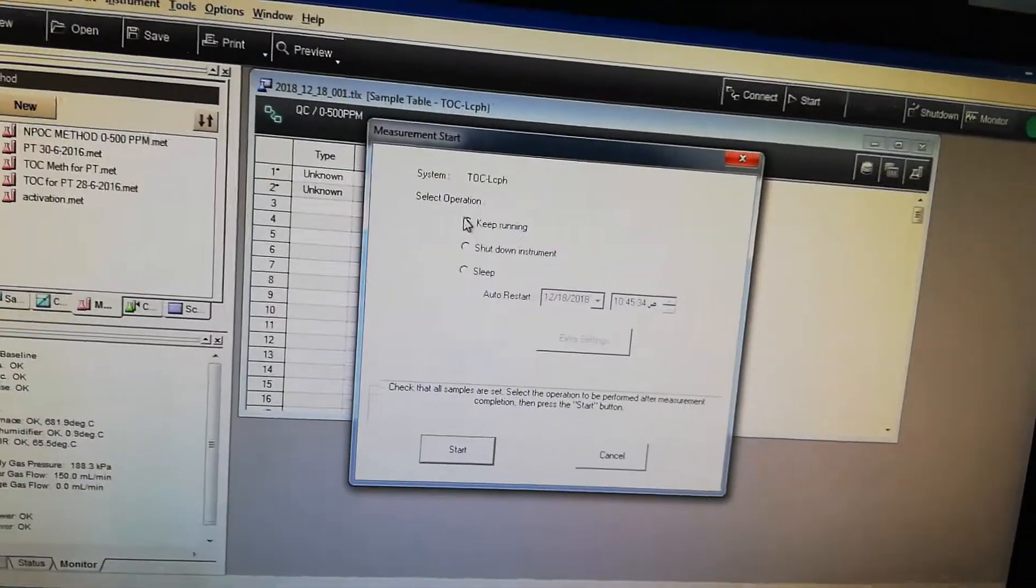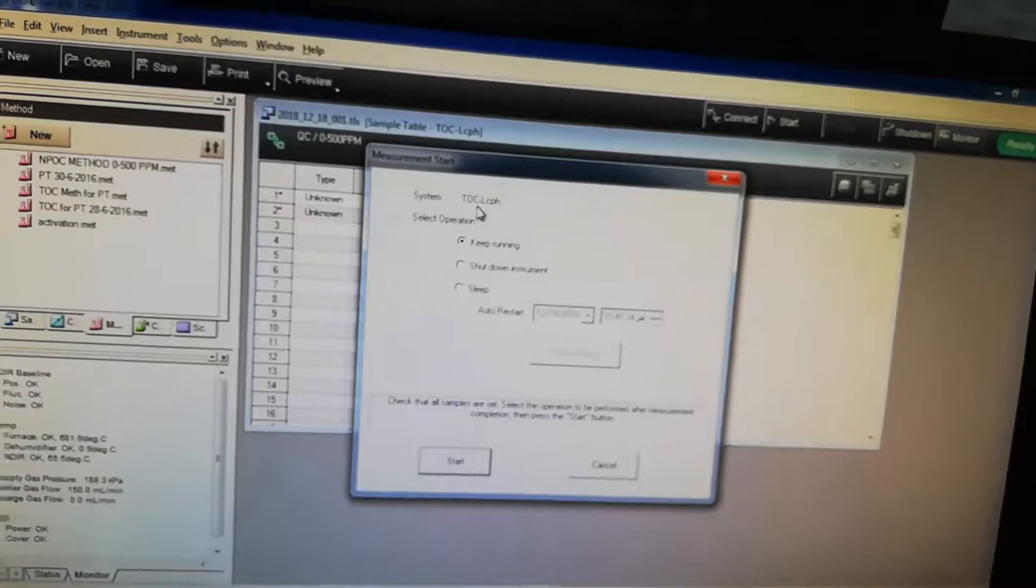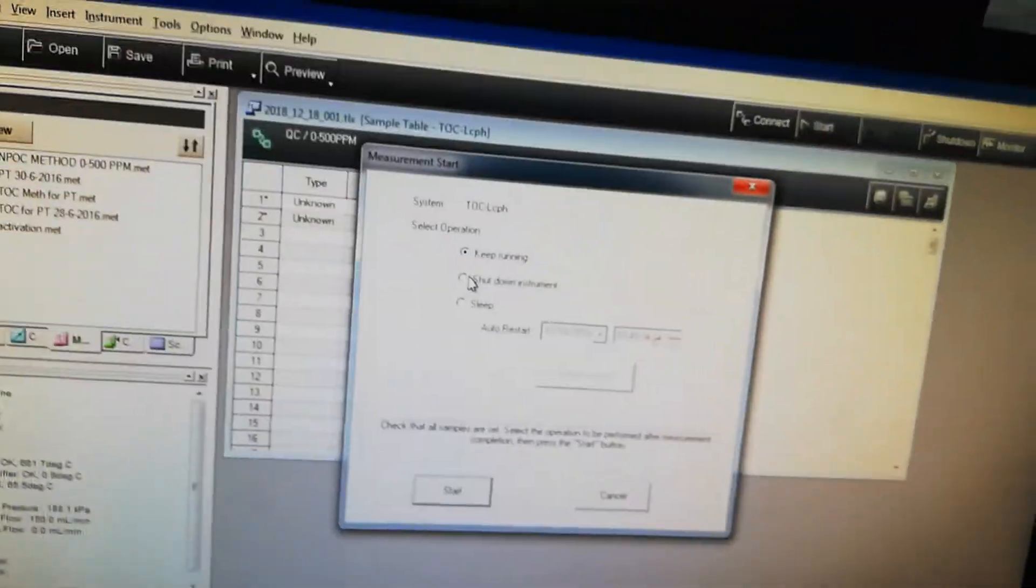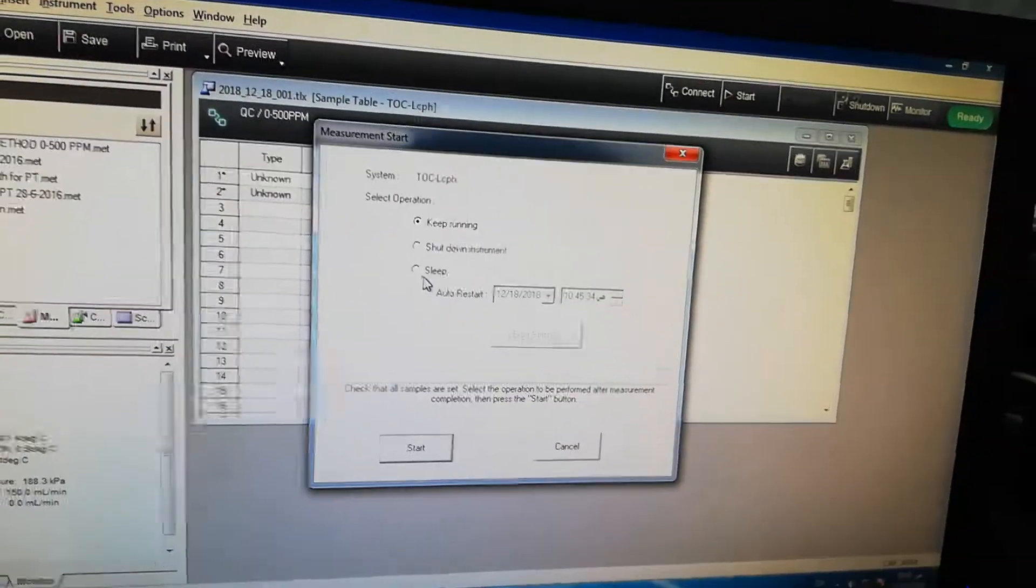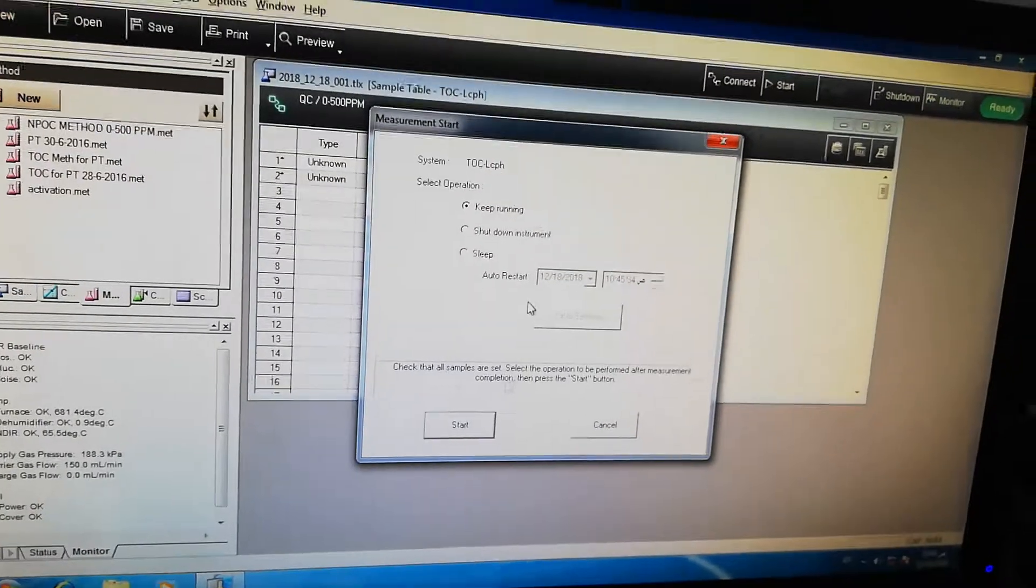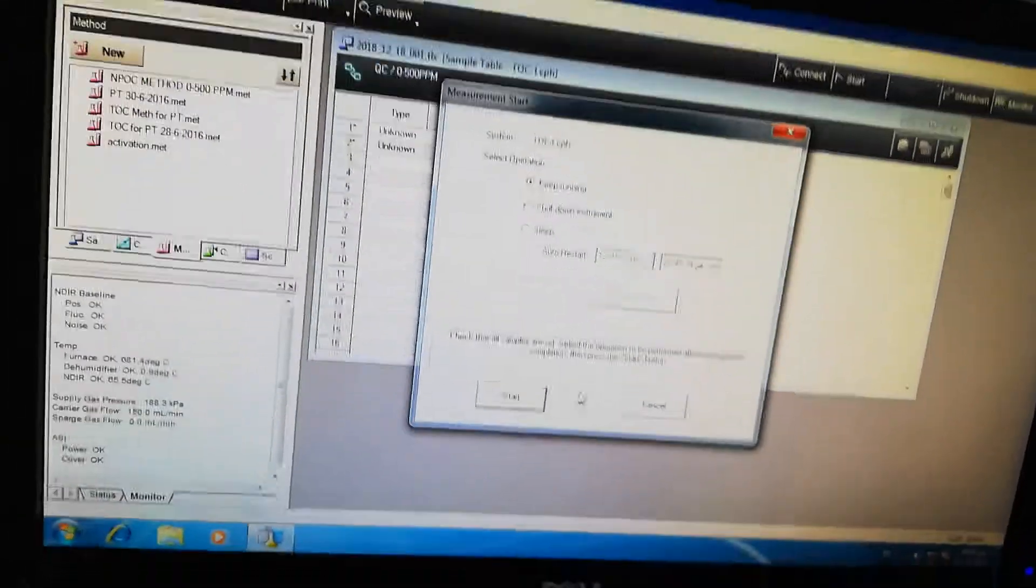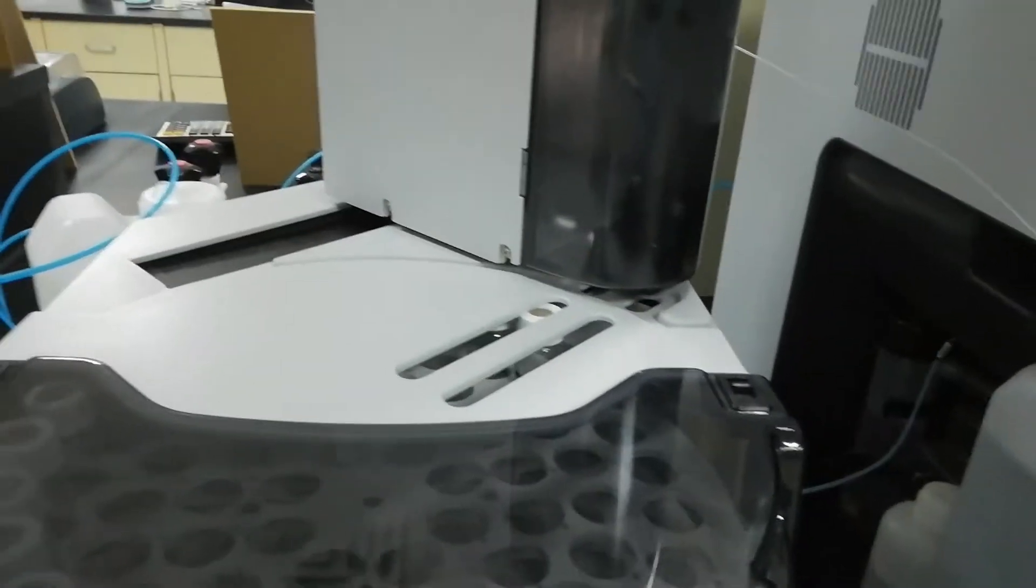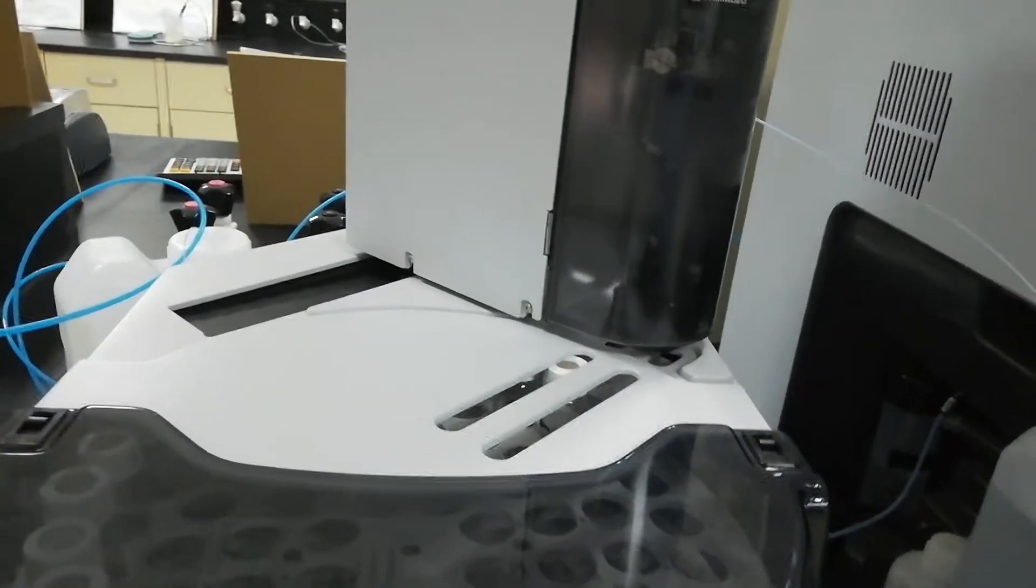And after that, there are some parameters that what you want to do once the analysis is finished - keep running, shut down the instrument, sleep, like this. So anything which you want to edit, you can add it. Then you have to press start, and now you can see that auto-sampler has started working.